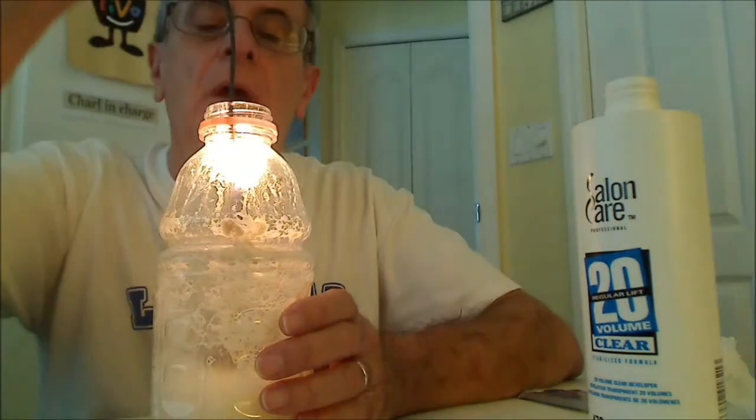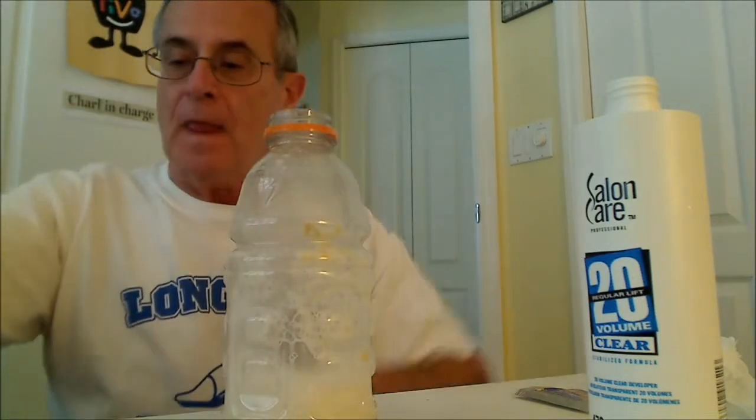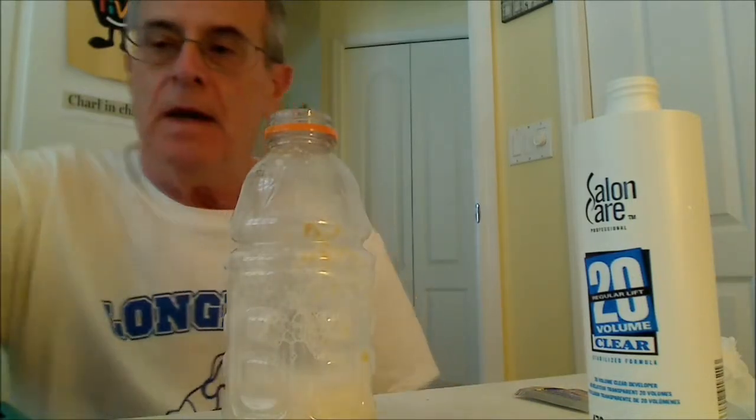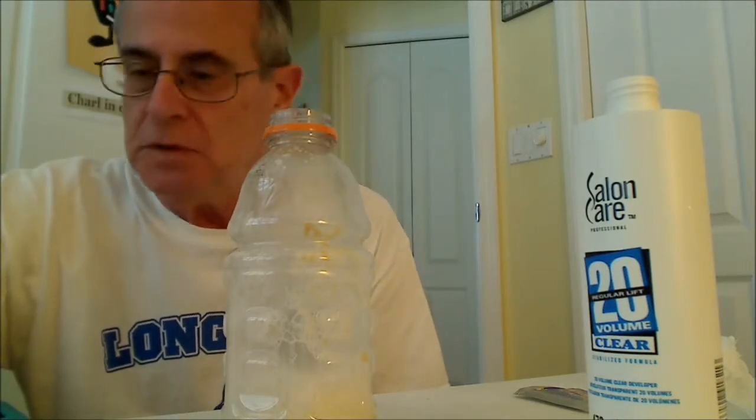I got it to go again. So I think that's a nice illustration of a catalyzed reaction without producing a lot of smoke in the room, using the candle.